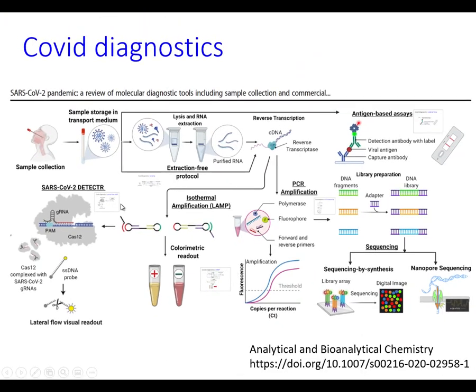So we've talked through how we collect sample and the two lateral flow based assays, the antigen based assays, which are in huge use these days, and the lateral flow CRISPR-Cas based ones using amplification. The next step is to talk about how the majority of testing was done in the beginning through qPCR, quantitative PCR. So if you remember, the first thing we've done is to get our RNA and copied it into cDNA, and then we use a PCR based reaction to amplify it.